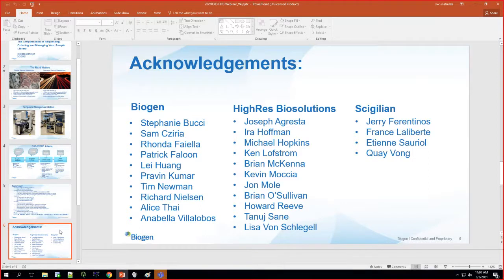Someone else has a question of, do you only have 300 nanoliters of compound in the LP200 plate? Oh, okay. So the 300 nanoliters is what was transferred into the destination plate. The LP200 plate, as you know, you can have up to, I think, 12 microliters in that. And I think we usually have about 10 microliters in that. And then every time, I'm glad you brought this up.